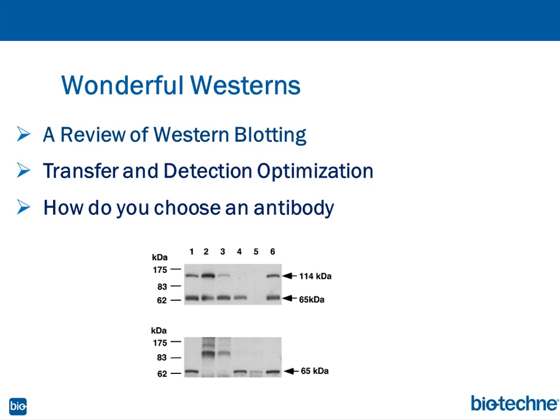The purpose of this webinar really is about understanding the variables of Western blotting, and by understanding the variables, you're better able to troubleshoot and manipulate those variables to give you the best signal to noise. So you certainly don't have to do what I'm suggesting, it's just apply what you need.